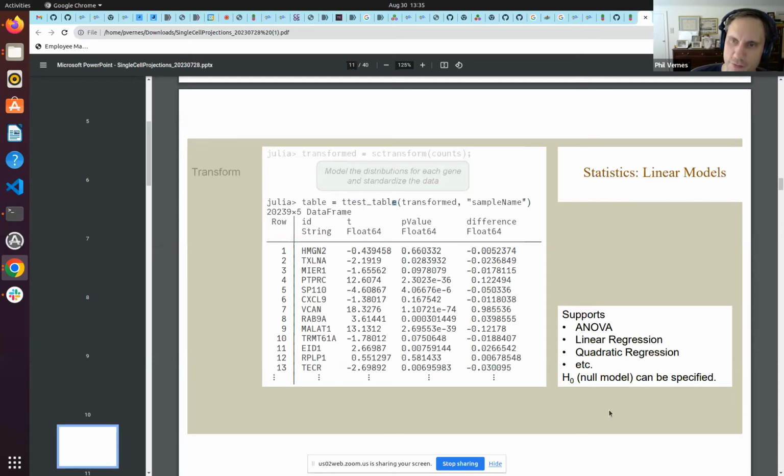There are a bunch of statistical tests that you can apply to count data across samples. So, for example, as you've noticed, in our example we have P1 and P2 samples in the same data matrix. You have the option of testing across that. And these tools are handy because, one, they work, but two, they account for having multiple samples in the same data structure.